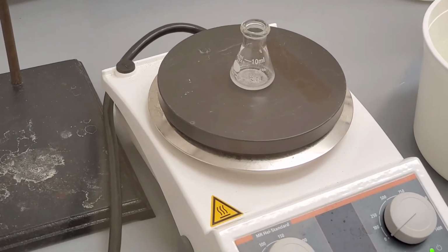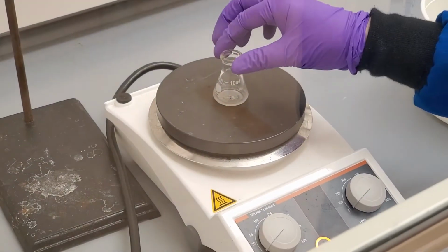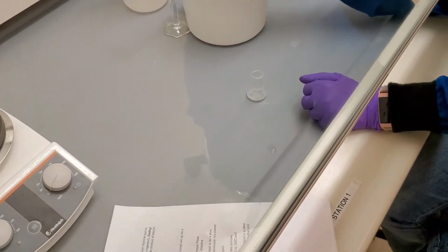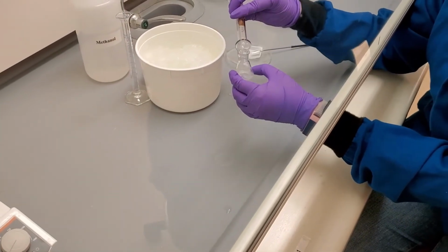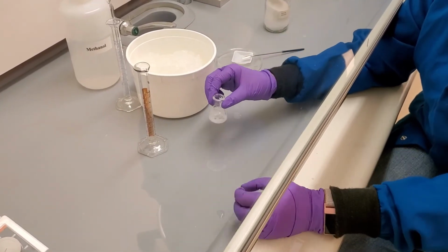After 3 minutes, we turn off the heat plate and allow the reaction vial to cool to room temperature. Once cooled to room temperature, we add the 4 milliliters of deionized water that had been cooling in the ice bath. As we add the cold water, we can see a white precipitate start to form.